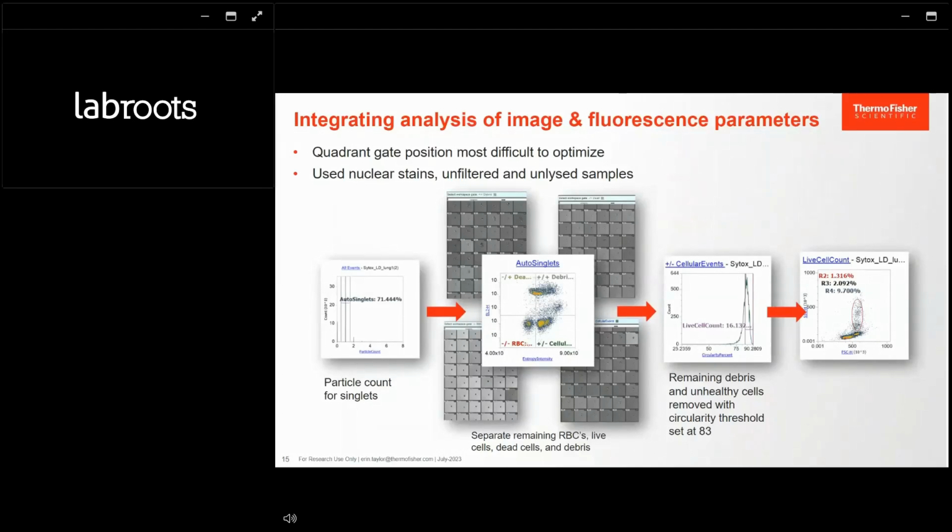So it's always a little disappointing to start using this and realize exactly how much of our samples can contain debris and need some extra cleanup steps. And here I have just plotted this live cell population back onto forward scatter and side scatter, so I can see the distribution of likely populations, what's included in this population of healthy cells. And once this was developed, and I felt that I had proved it to myself that this was effective, I have been able to use this and compare it across multiple samples.